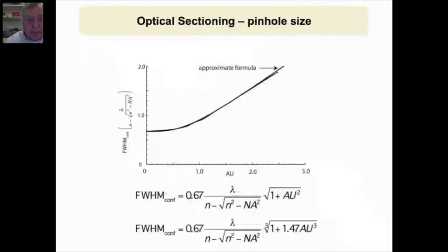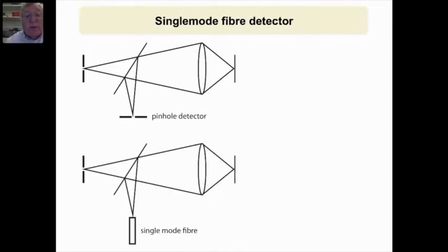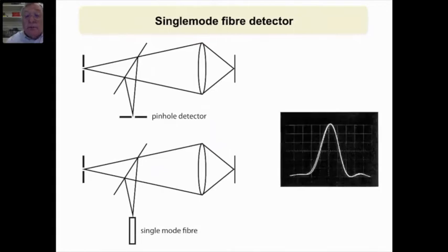Absolutely true. And there are all kinds of formulae for what the strength of the optical sectioning is as a function of the pinhole size. You don't need to use a pinhole, and actually you can do, in some senses, better if you use a single mode optical fibre. You get exactly the same kind of optical sectioning.